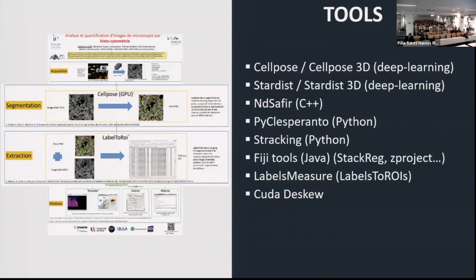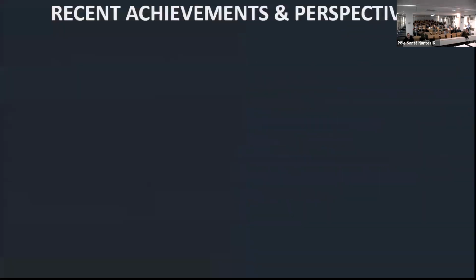The idea is to show you that we are not limited by the programming language. You can import, add some Python script or C++ or Java or Fiji macro. You are really free on that. To finish, some recent achievements and perspectives.